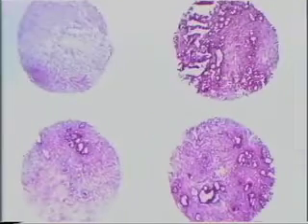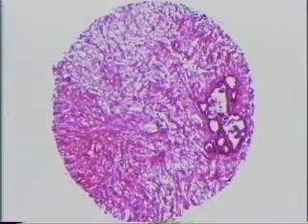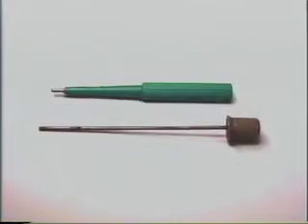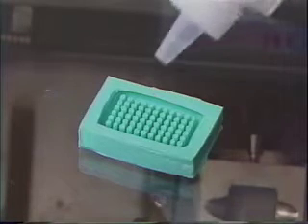The Cryo Array is a simple and easy way to produce multi-sample fresh tissue frozen arrays. The needle is a disposable two millimeter derm needle. A stylet was created to assist in removing the tissue from the needle. A mold is used to form the base of the Cryo Array.